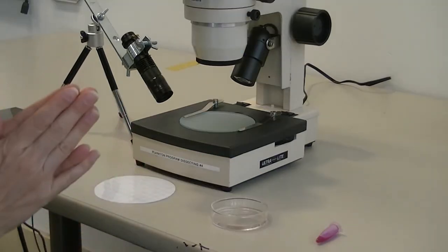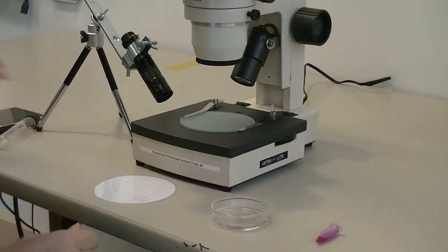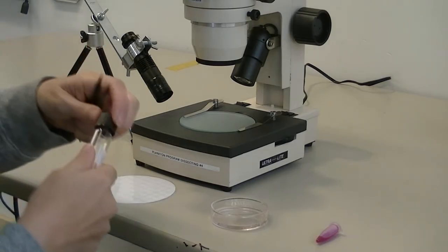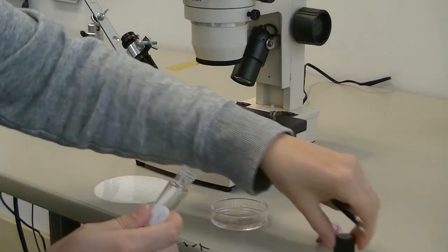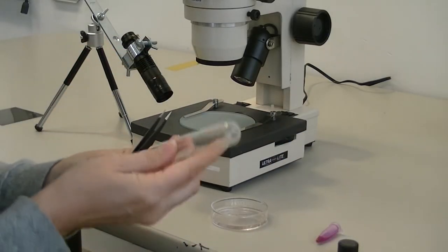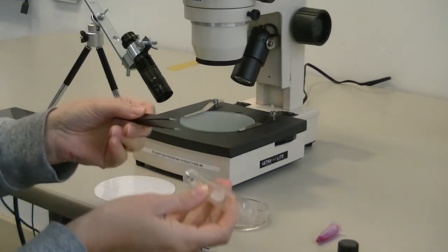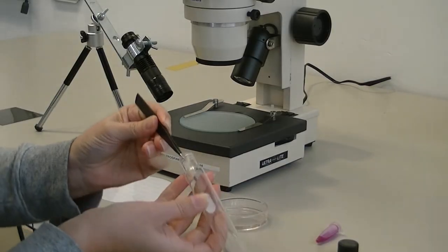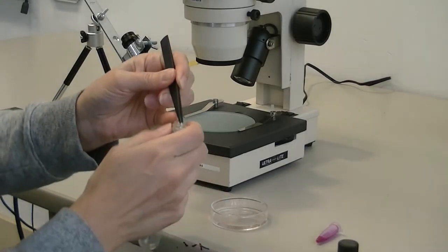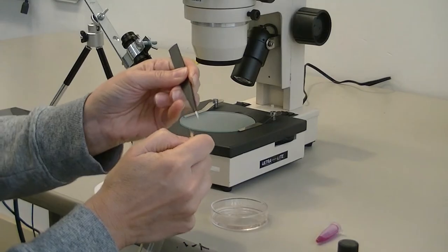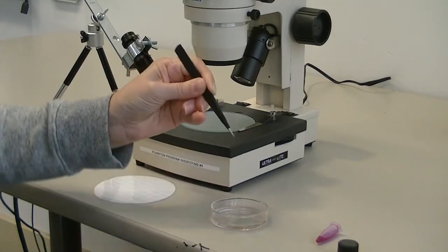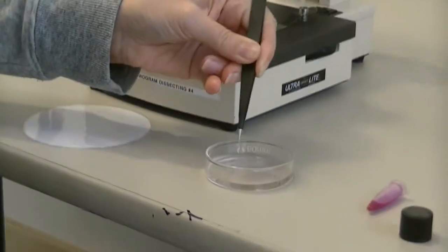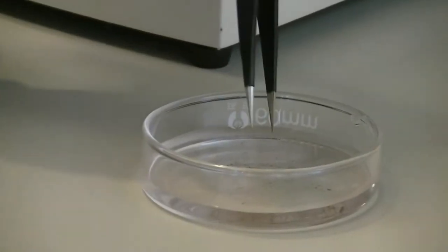After you put your Nile Red dye in, it's a good idea to put in a control sample of plastic, which we have here as cigarette butt filter fibers. I've got a little fiber on here. Actually, it's kind of a group of fibers.